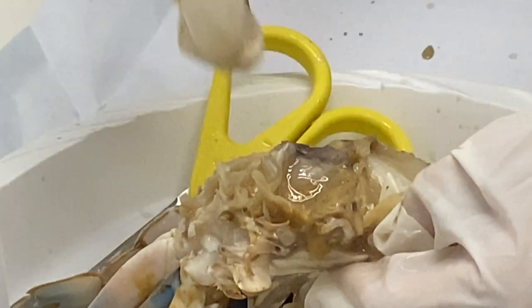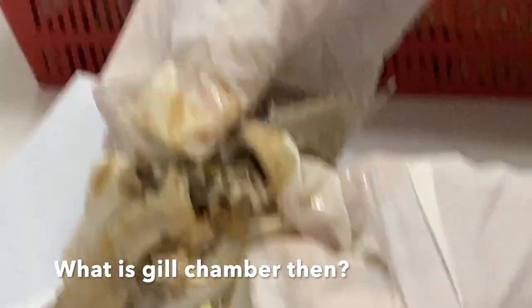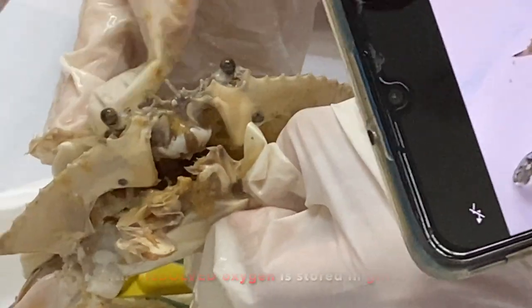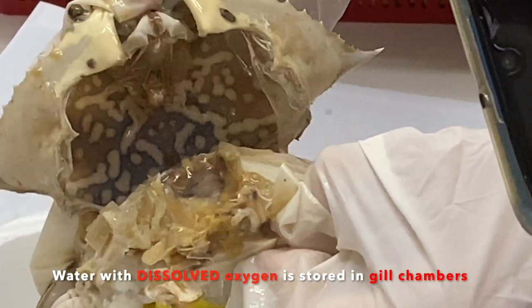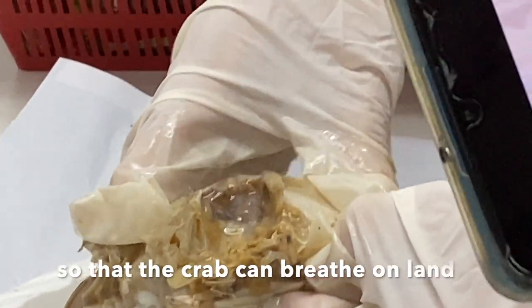Now this one doesn't really have eggs. So all these are the gills. Okay, so that's it. What is the gill chamber? The gill chamber is this place — can you see the water is actually stored inside here? The water is actually stored inside here, so this whole thing is the gill chamber. Understand? Yeah, got it.